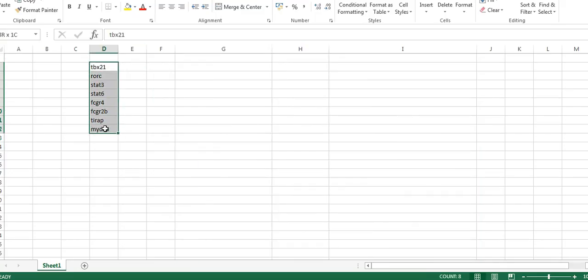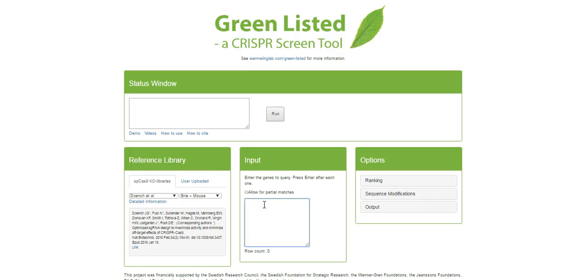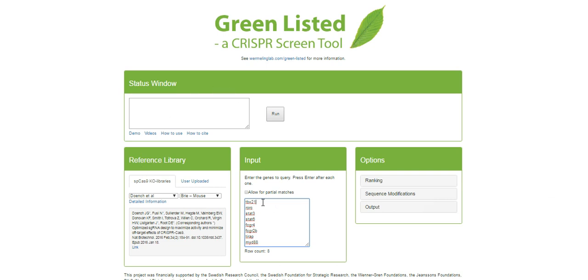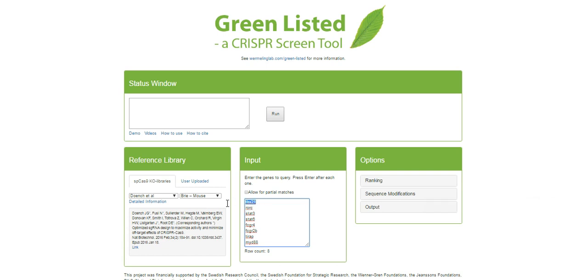And then you want to input the genes you want to target here. So here I just made a list here. You would copy them in here. And here, just a few, choose a few of them. But of course, you could take as many as you want. And basically, what you're telling the software now is, okay, I want to design guide RNAs that target this gene, this gene, this gene, etc. And I want to use the guide RNAs suggested from this publication. And in this case, we know that this publication suggests four guide RNAs for each gene, more or less. So if I press run here, you would get four guide RNAs for this gene, four for that one, etc.